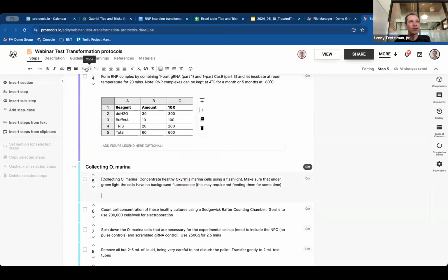We talk about it on our webinar, code components. You can insert images and videos easily. So it is easy to attach links, images, videos, just sort of drag and drop the video in here. But if you are using YouTube or Vimeo, you can also embed the video that you've posted.